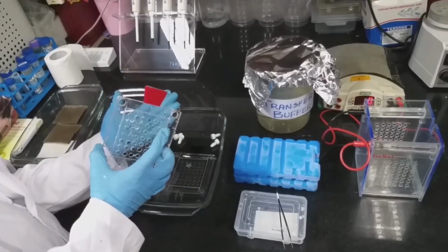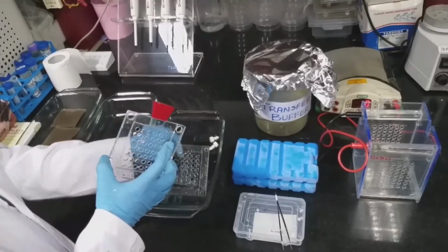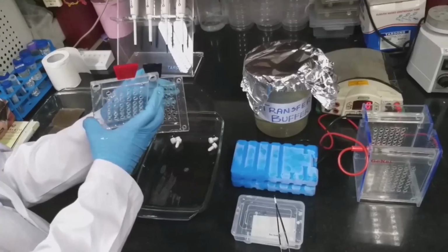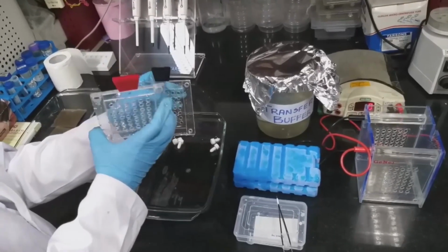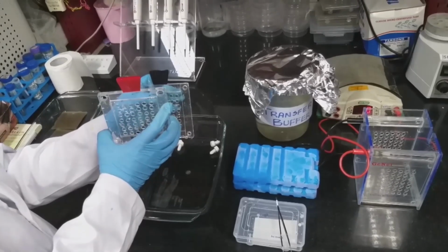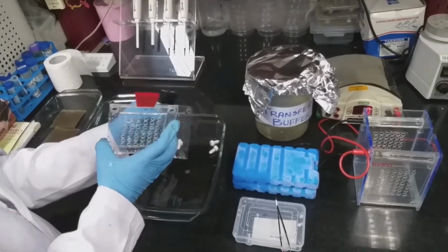So when we apply voltage from this side to this side, the negatively charged protein will move to the positive side and be captured in the membrane.